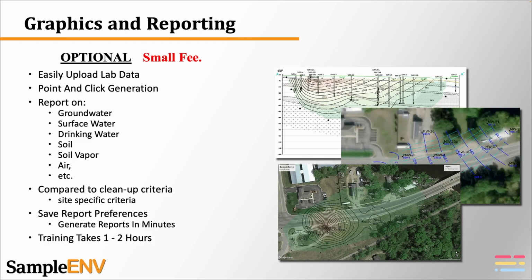Once the lab is done with the analysis, typically a week or two later, data can be uploaded back to the SampleServe platform in any number of ways. Data can be uploaded by the laboratory, it can be emailed to the client, and they can upload it. There's also an automated email function where they can email it back to SampleServe and it will upload automatically.